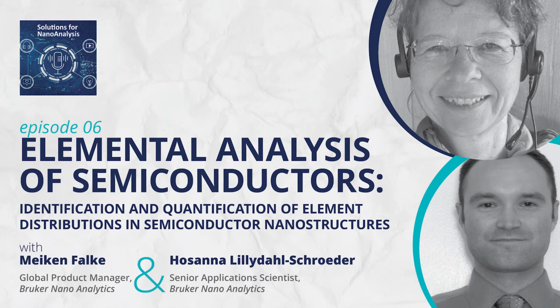And at some point, somebody came to SuperSTEM and said, shouldn't we add EDX to our TEM? And we all said, no. We do everything with EELS. We don't need EDX at all. And then one day I was tasked to analyze a specimen, which was tissue from the lung of a patient who lived very close to a road with very heavy traffic. And I was asked, couldn't you identify all the nanoparticles in the lung of this patient? And I tried hard, and I'm pretty sure I didn't find all the elements which were there.